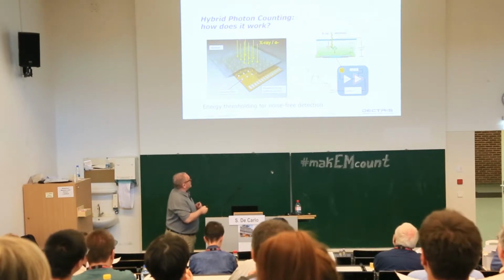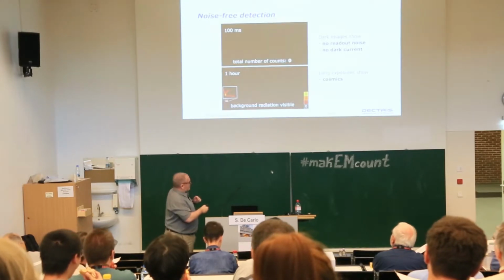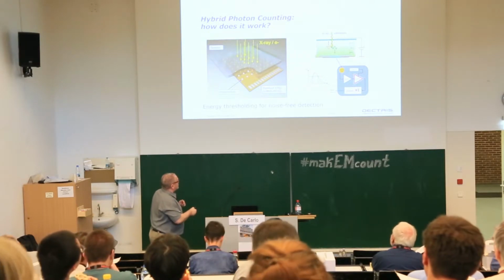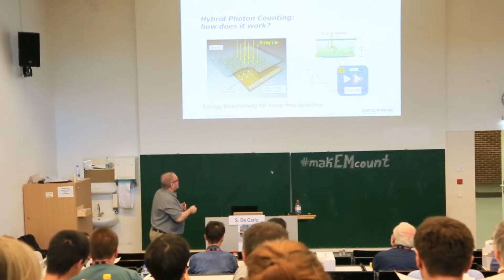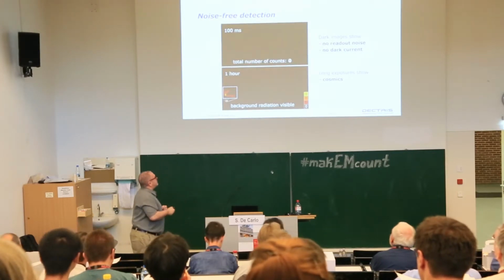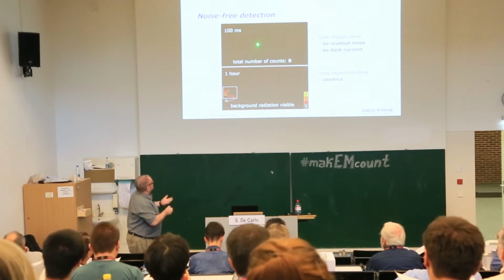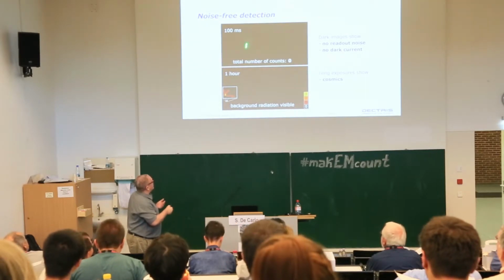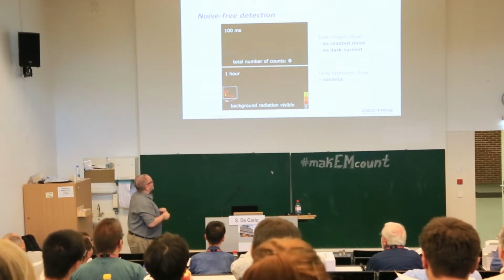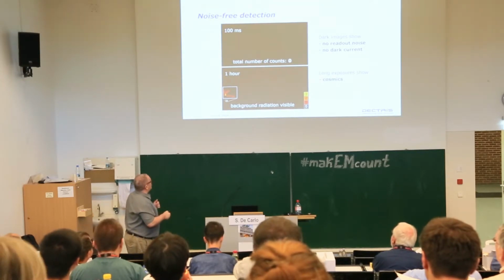And I will come to that again later to explain in a bit more detail. So this energy thresholding gives you a means to get what we call noise-free detection. Of course, there is a lower threshold, but in principle, what it means is that when your detector is triggered and initialized but you have no beam whatsoever, for a short exposure time you really get a total number of counts which is 0: no readout noise, no dark current above this threshold.